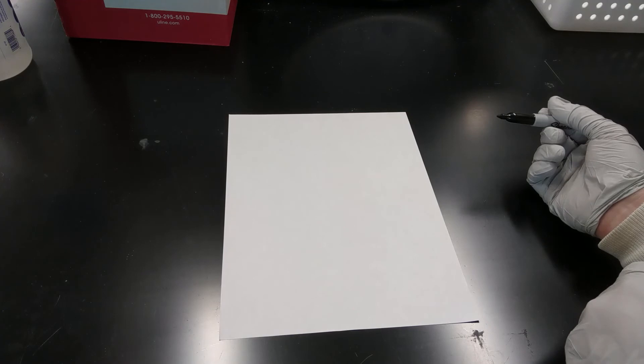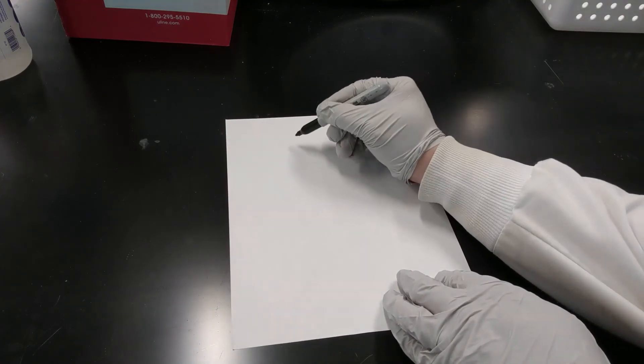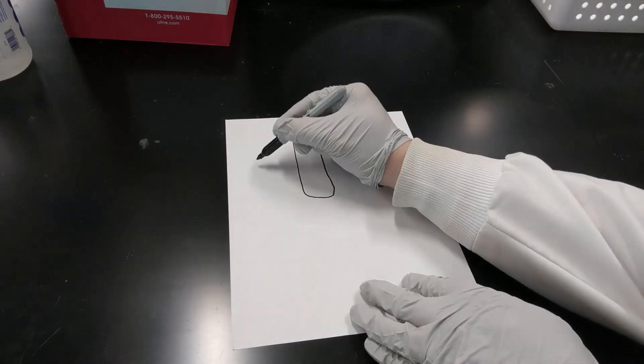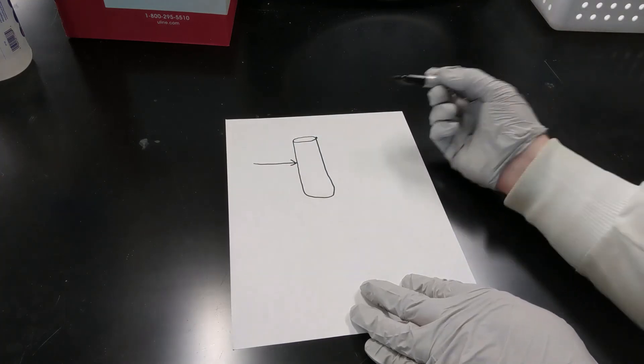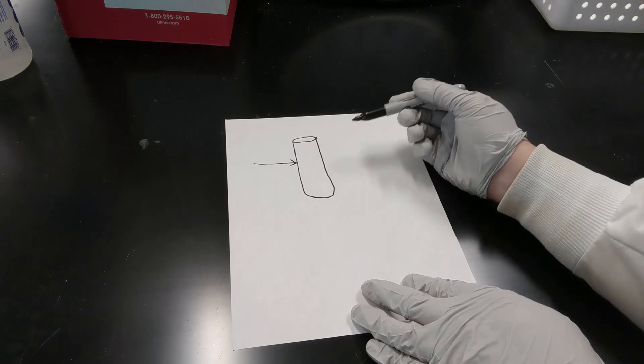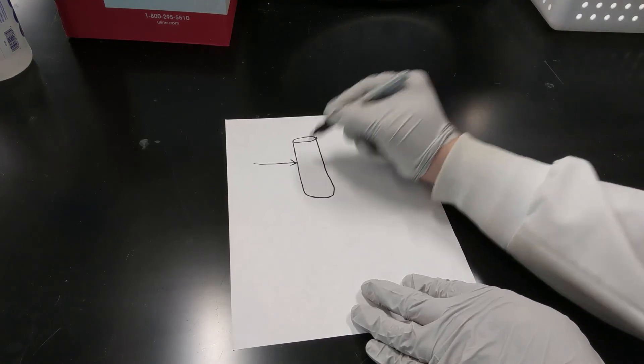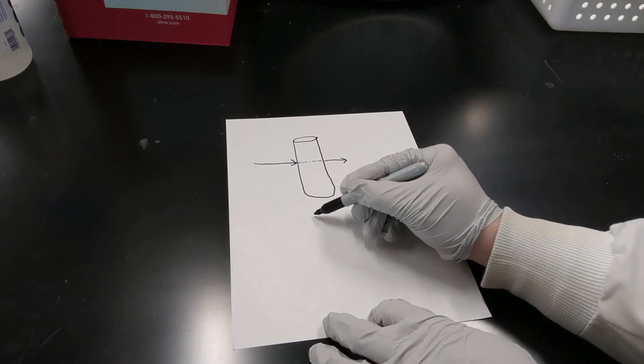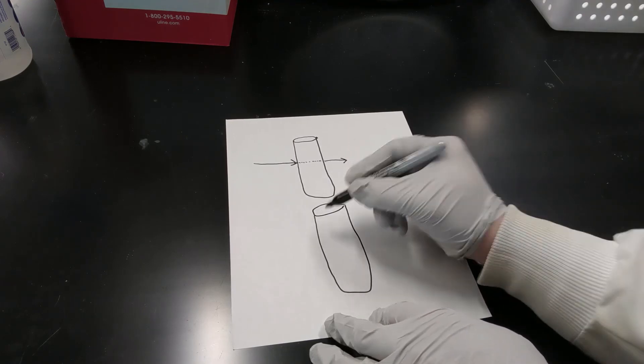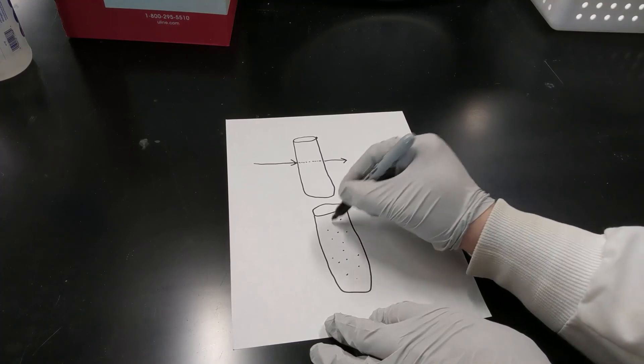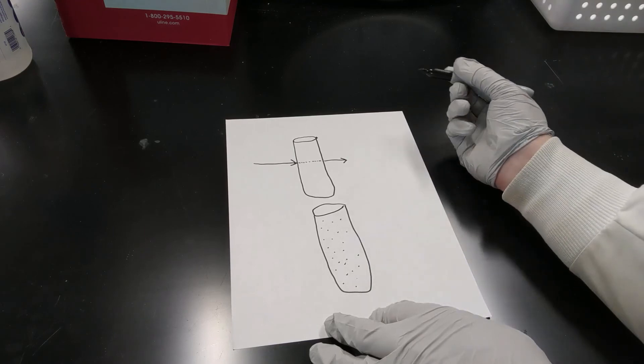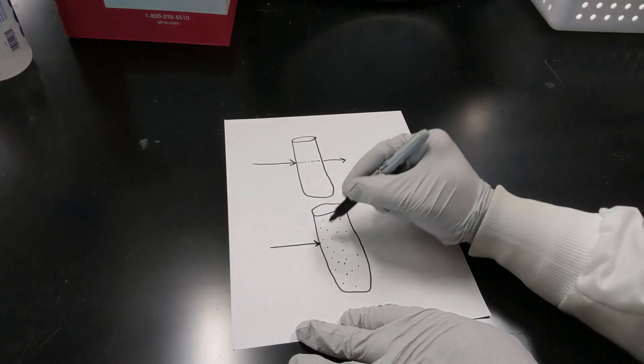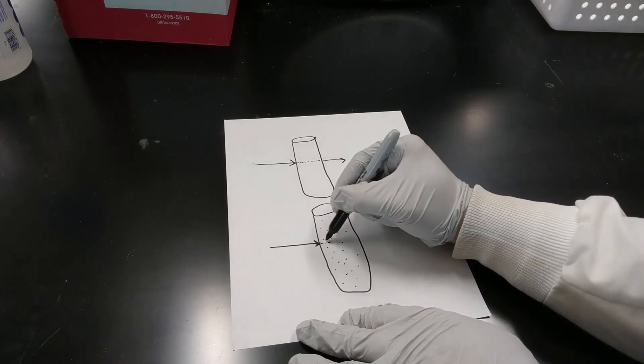So I've explained that what it's doing is an optical technique. And what that means is we have our measurement cell and it is shining light through one side of it. We'll say it's coming in this way. If that liquid inside that cell is clear or mostly clear, then just about all of that light is going to travel straight through and come out the other side. However, if we have a cell that is more turbid, that means that there are tiny particles dissolved and suspended all in that solution.